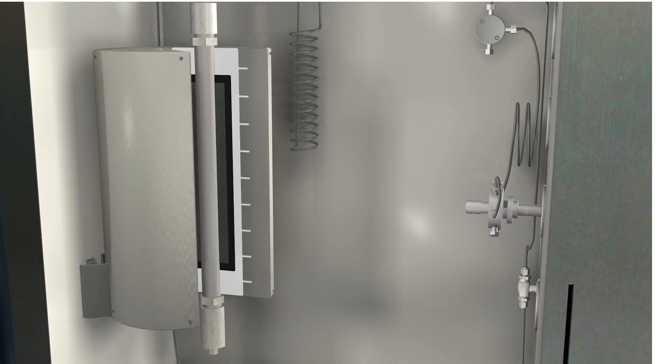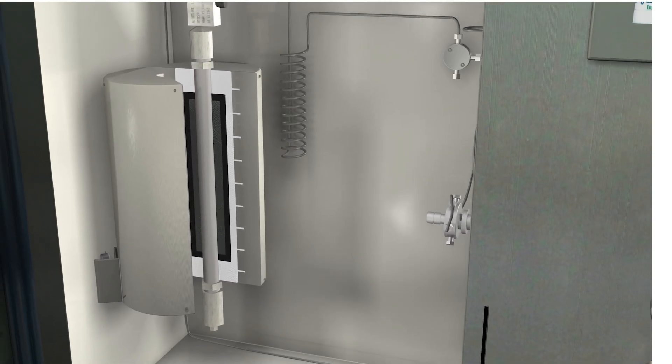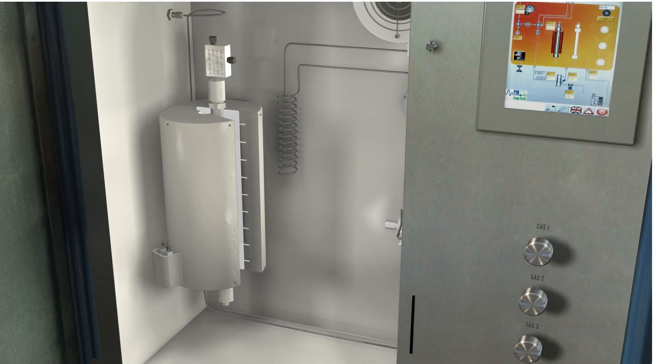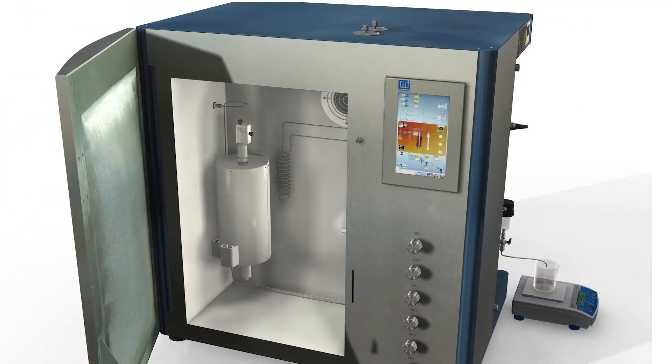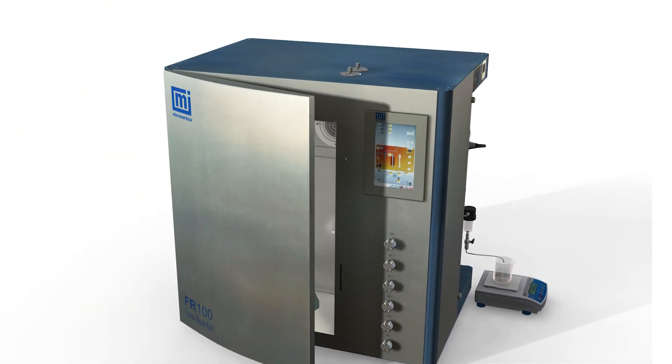Now that the activity of the catalyst is understood, you can comfortably scale up and produce the final product.